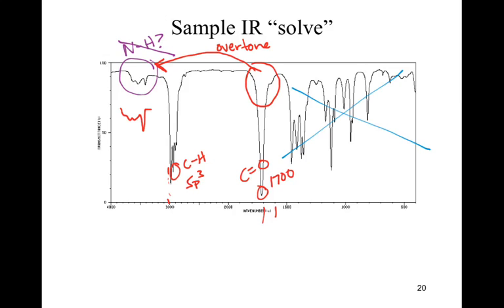Whether or not you're right ultimately comes down to what spectra you've got to work with. Like I said, it's really going to come down to practice. Go ahead and download that IR activity. Go through and start working some of those problems. It's going to require you labeling multiple things back and forth. Use the spectra packet.